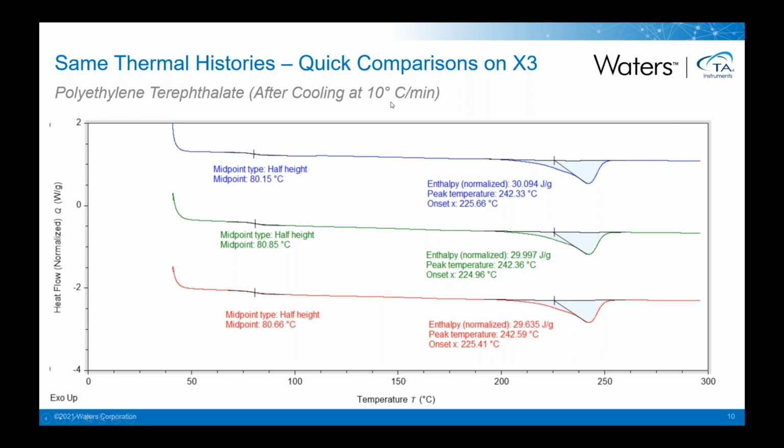We've controlled the cooling, controlled those rates, and we've been able to see the similarities between the materials rather than in the first case where we might be seeing differences. So, maybe it's a material that comes off the line, and you're taking a sample at the top, the bottom, and the middle, the front, the beginning, the middle, the end, side to side. Maybe that shows you variations, but obviously the concentration or the composition of these materials is the same.